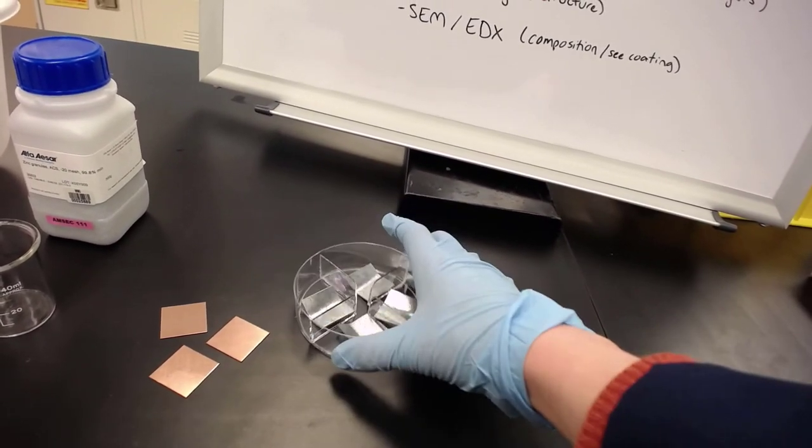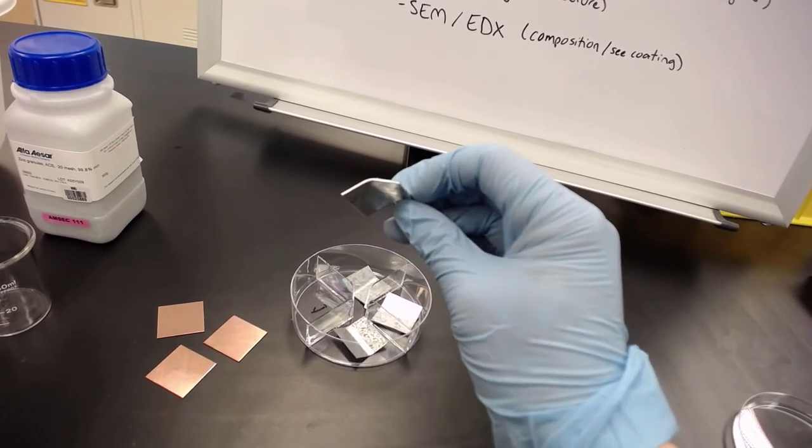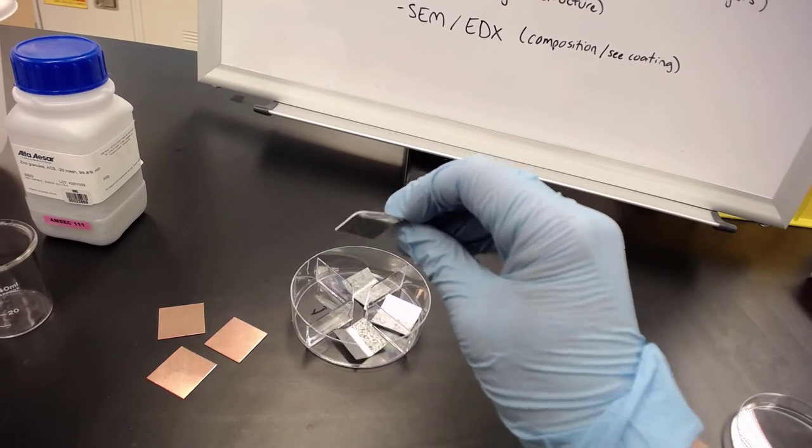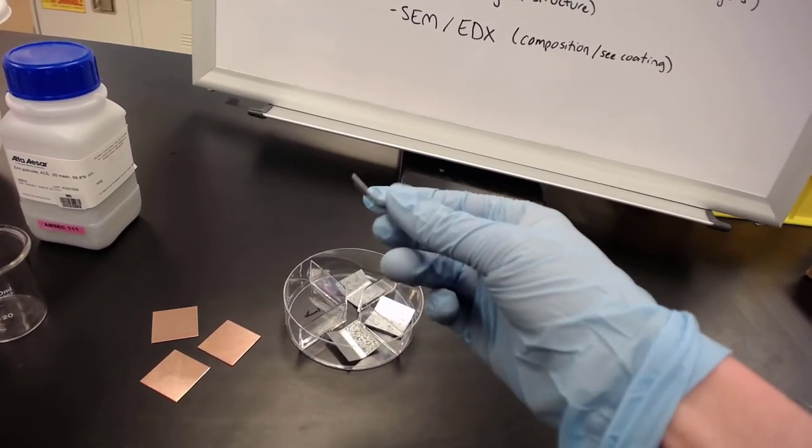We've already bent our samples into a V-shape to help when we're putting them in the HCL to remove the coating. This helps the bubbles escape from underneath.